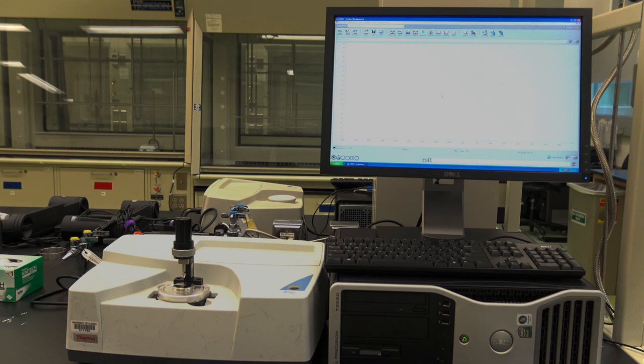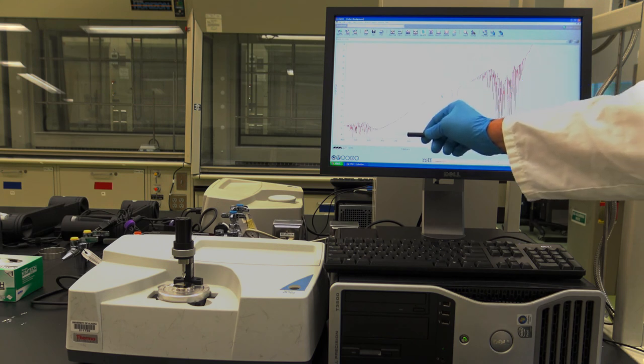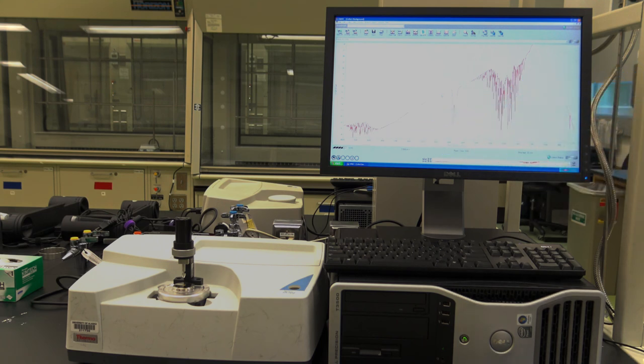So now I'm collecting 16 average scans. And there's the first one. And now it's going to be collecting more scans and then averaging the data. You can see there are transitions here. A lot of transitions. A big one and some smaller ones. All these are due to gases and water in the atmosphere.